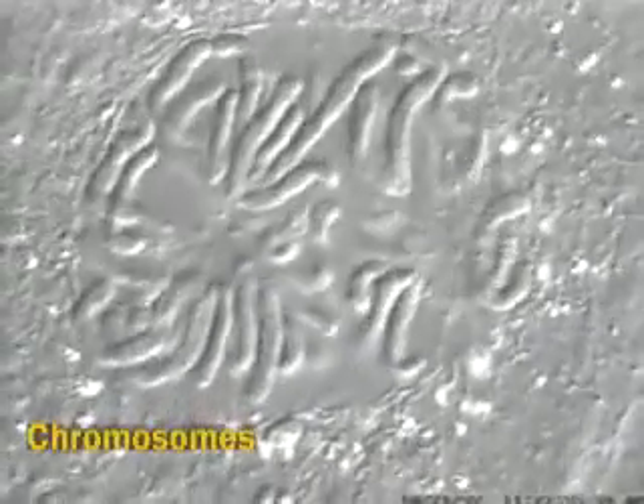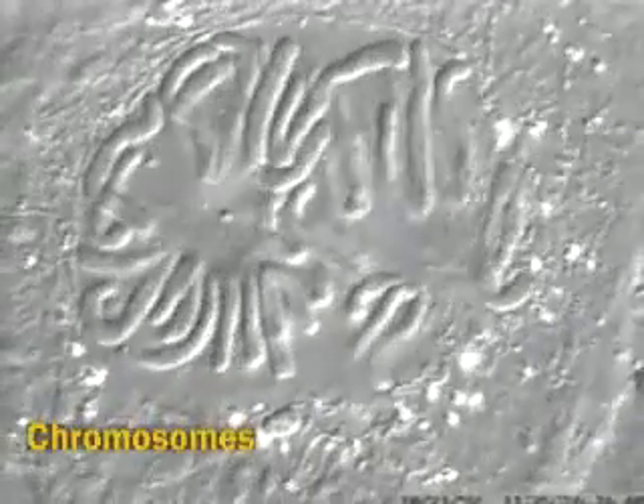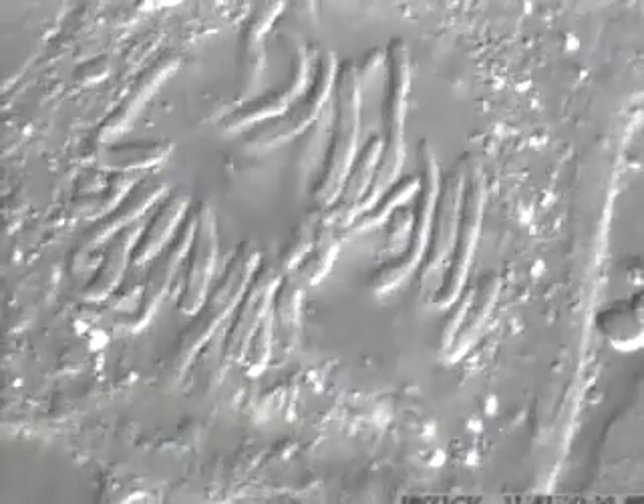This is a time-lapse movie of a dividing plant nucleus. The movie is greatly speeded up. Even so, you can see that the chromosomes take a long time to start moving in an organized fashion.